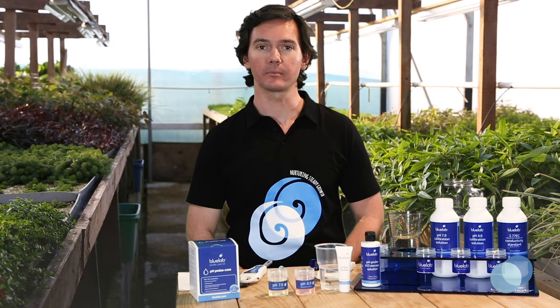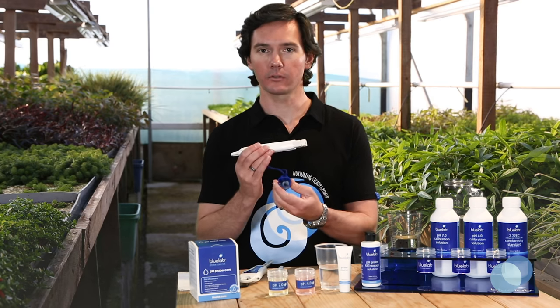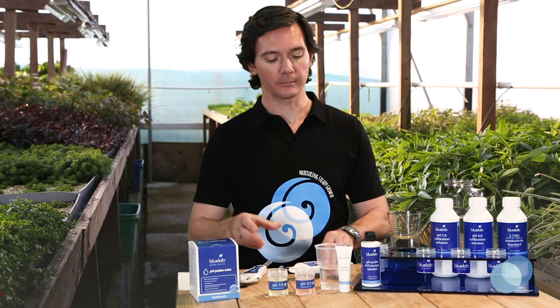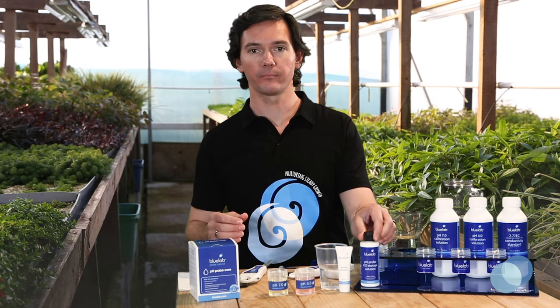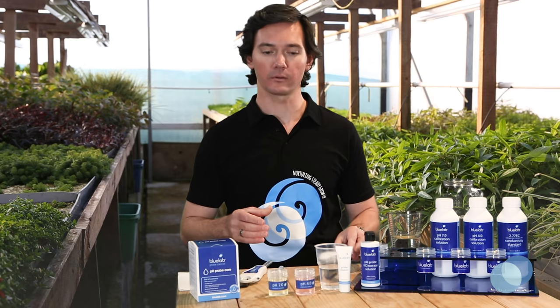Always ensure that your Bluelab pH pen probe glass tip is kept wet. To store your standard pH pen, check inside the storage cap and look for the foam insert inside the bottom. Check that it's still wet. If it's dry, just add a few drops of Bluelab pH Probe KCL storage solution to the foam. Then, simply put the cap back on, and you're ready to store it.